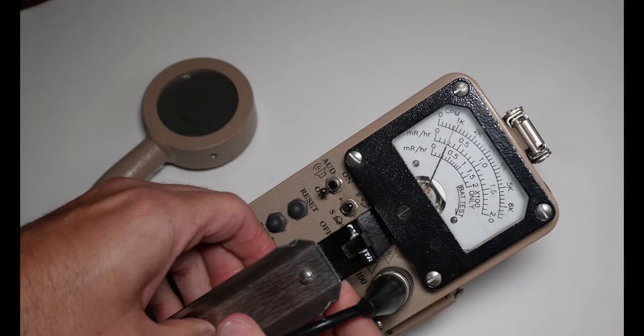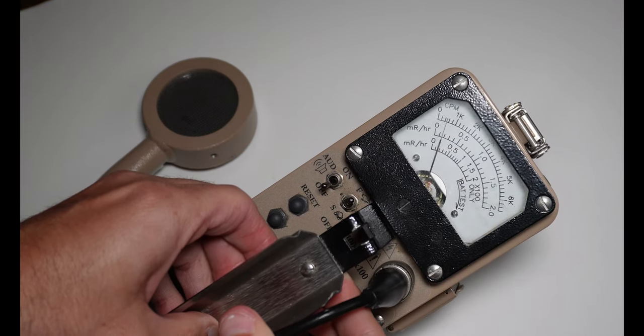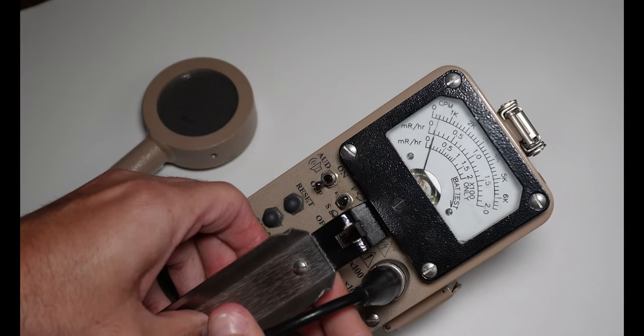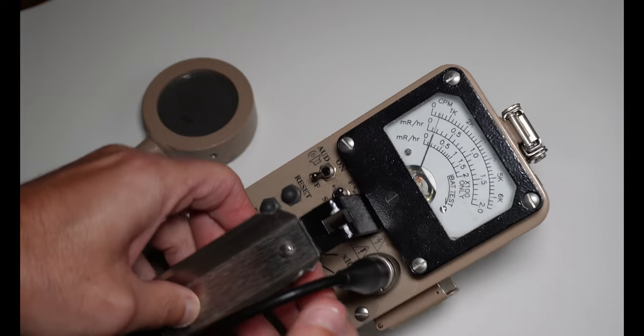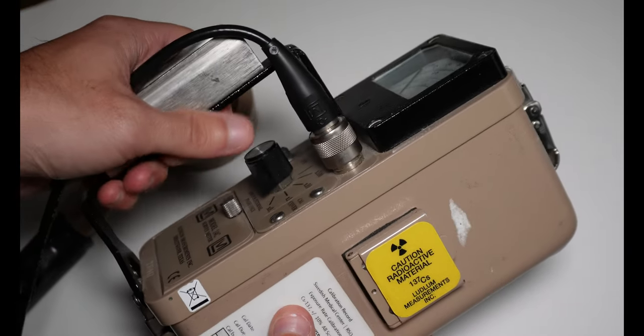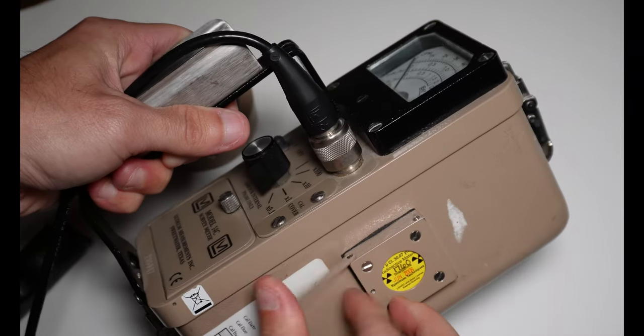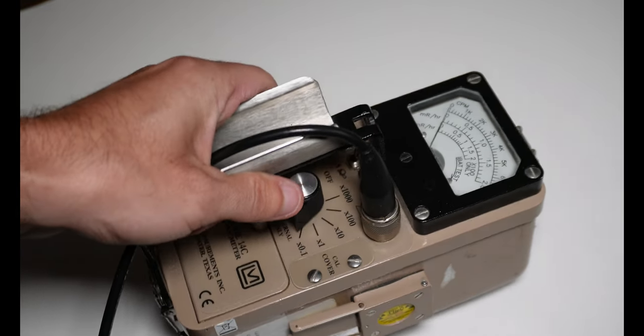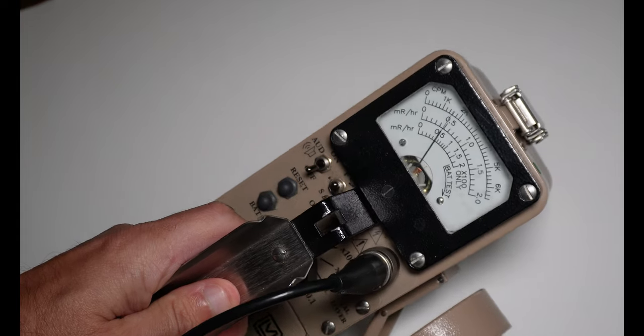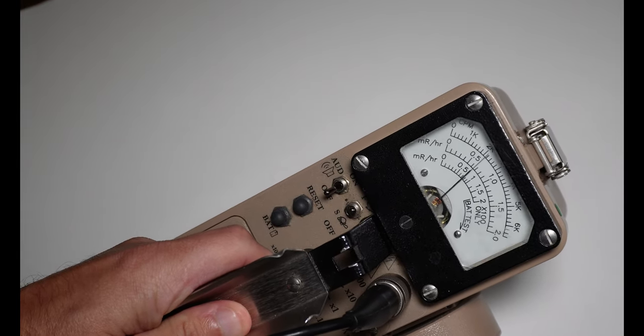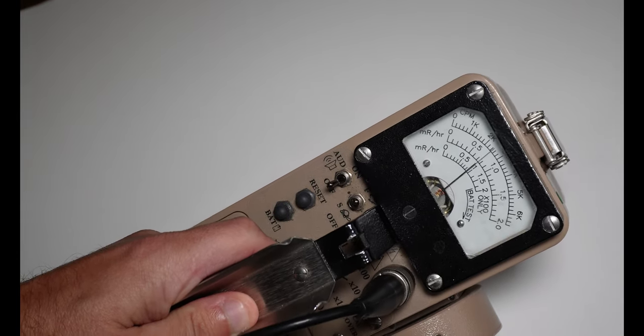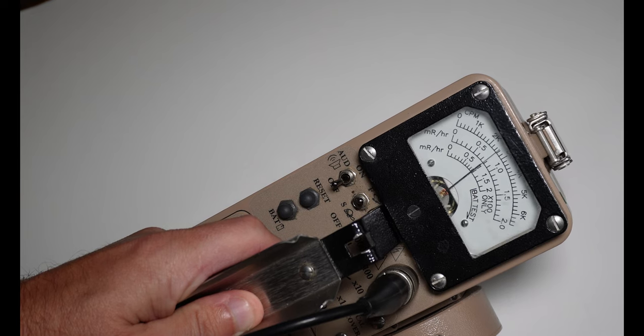The next step is we want to make sure that we get a good response from the instrument by checking it against the check source. So recall that the check source for this survey meter is on the side. We're going to open up and we're going to put the pancake detector against the side of the source and we're going to make sure that we get a response here.